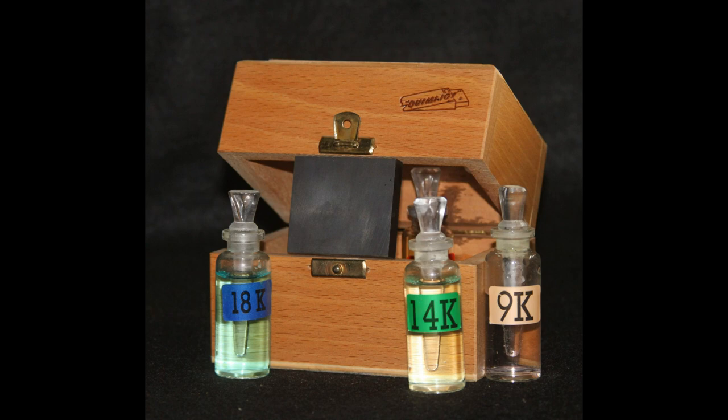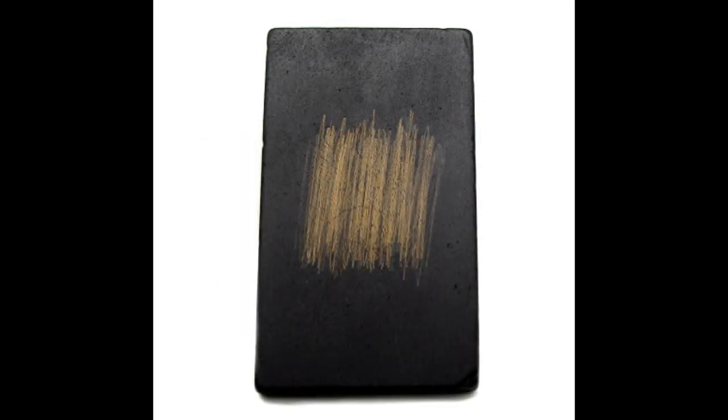When testing gold with the touchstone method, you want to make sure that the metal you're testing is completely clean of all foreign debris, oils, grease, and anything that might compromise the testing process. You will need a small tablet of dark stone such as slate or lydite. Before each use you want to ensure that the touchstone is thoroughly cleaned and free of any previous samples or leftover testing solutions. Place it face down on a piece of 320 grit sandpaper on a flat surface and sand off any sample material, then neutralize it in a bath of water and baking soda, rinse it off, and make sure that it is dry before its next use.